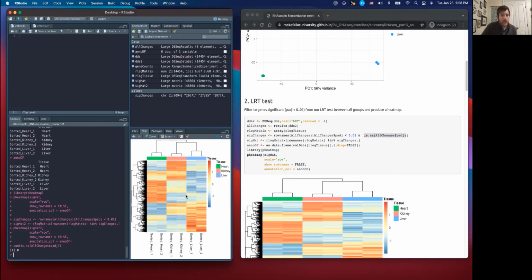Well, if you have an NA score or an NA value, quite often either these counts are super low or they're 0, or they might be NA values in themselves. Then if they get passed on to the pheatmap, if it's doing any kind of Z-score or it's doing clustering, if there's any NA values, it will break.